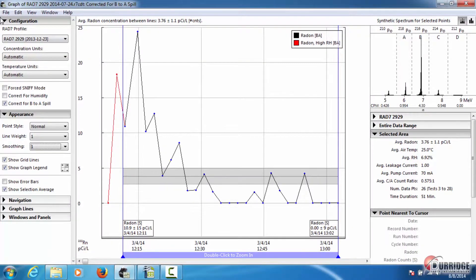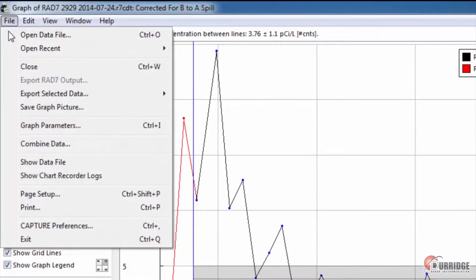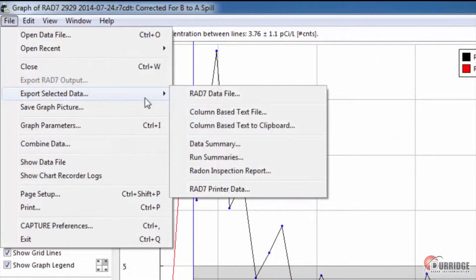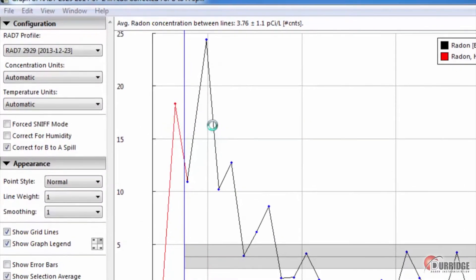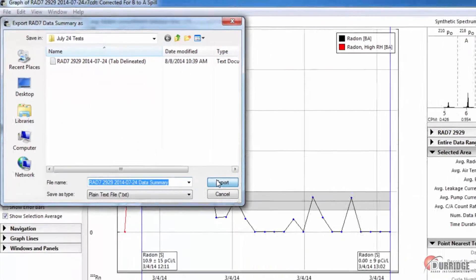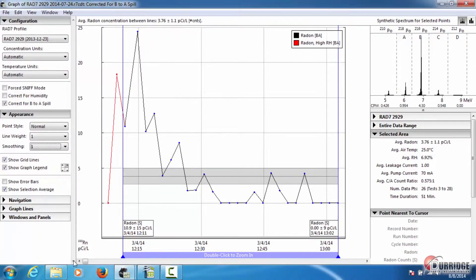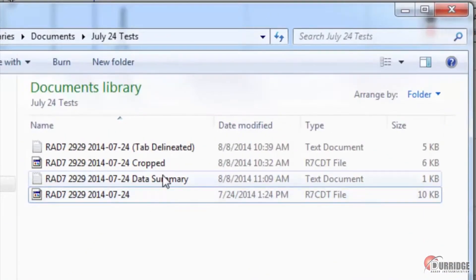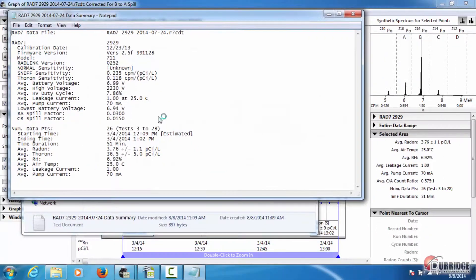Exporting a data summary saves the data as a text file that contains basic information about the RAD7 and the test data. If you select this option, pick a name and location to save the file. You can then open it in either a text editor or a spreadsheet.